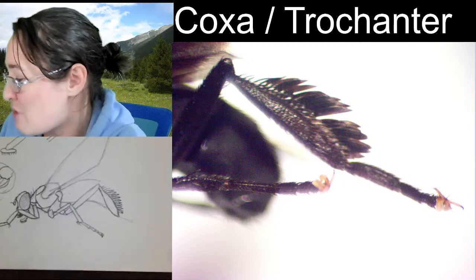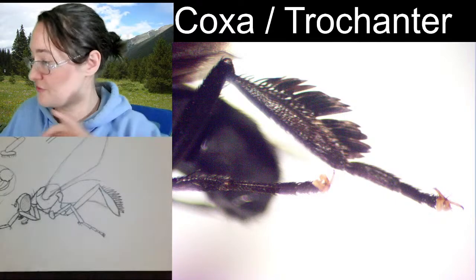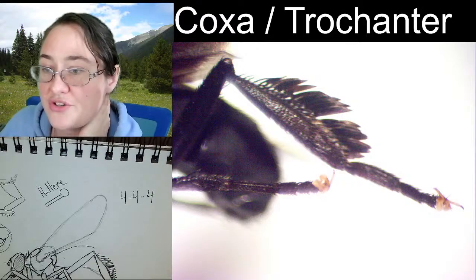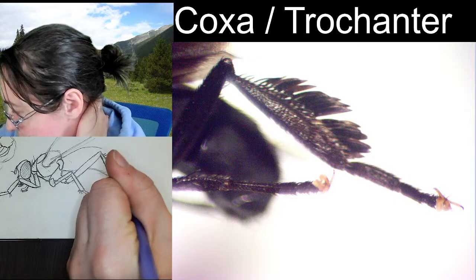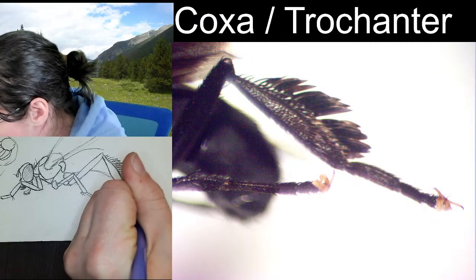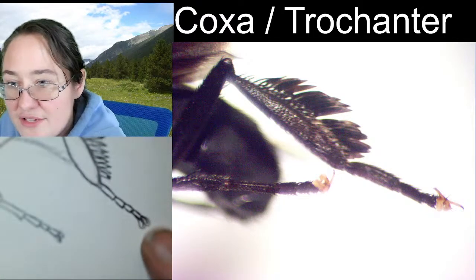Alright. The hind leg mohawk. Love it. Alright, then you have 1, 2, 3. Let's see if it's 4. I think that it's probably, yeah, it's 4. There are still 4 tarsal segments, so we are looking at a 4-4-4 tarsal formula on this fly here. And the hind leg, where it has longer femur and longer tibia, it's got shorter tarsal segments. My guess would be it's kind of to even it out, you know? 1, 2, 3, 4, little segment there at the end. And then you do still have the 2 tarsal claws, and you still get those pulvilli at the bottom of its feet. So I will draw them like this, like 2 little claws, and then half circles around them.